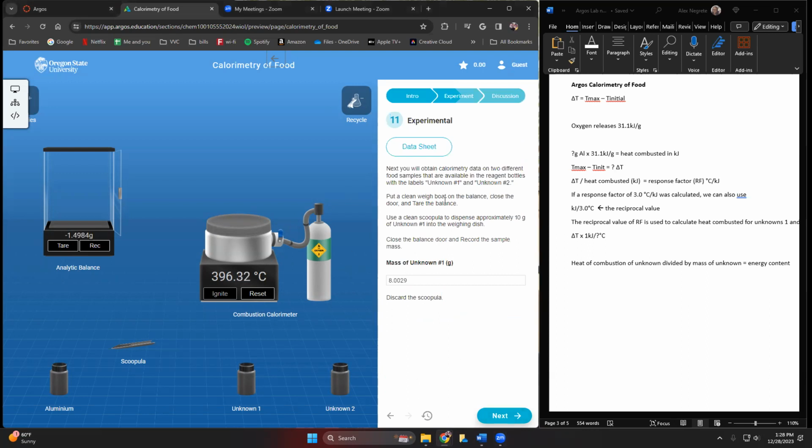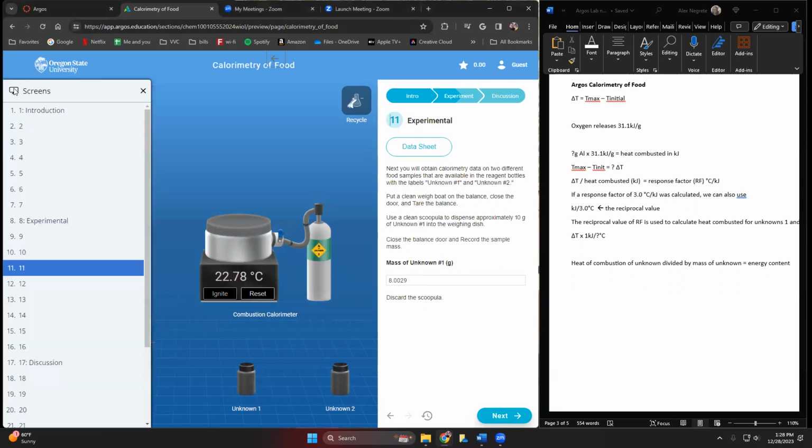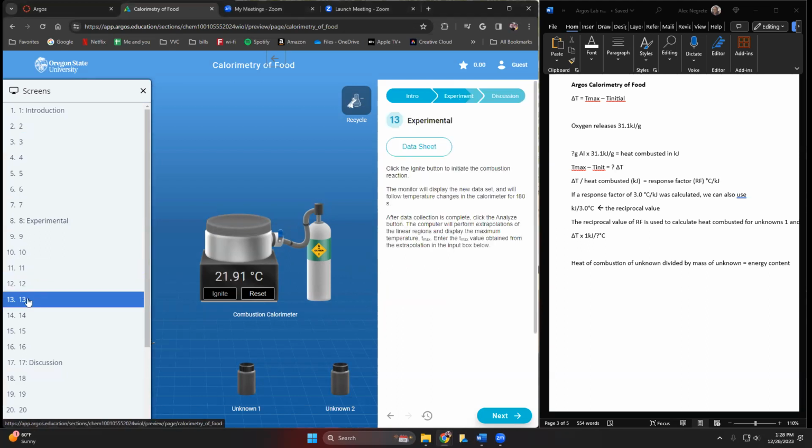And now you're going to go ahead and do these for the same process. You're going to repeat that. Remember to reset this. The resetting will clear all of that out. And then again, this value is in here already. It's not going to record a new value until you hit the record button again, and you'll get that for the unknown. So let's just go ahead and skip forward a little bit here.